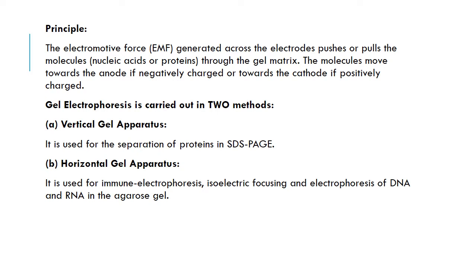So once that field has been generated, it's the one that will be involved in pulling or pushing the proteins across, or through, the gel. So now here is how the molecules will be moving. We are talking about the electrodes. We are expecting to have in mind the positively charged particles and the negatively charged particles.